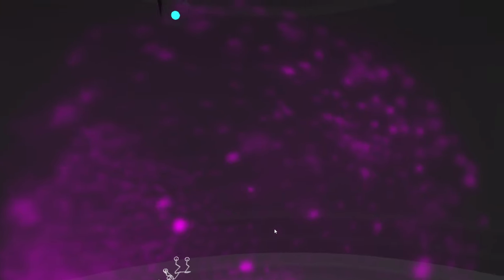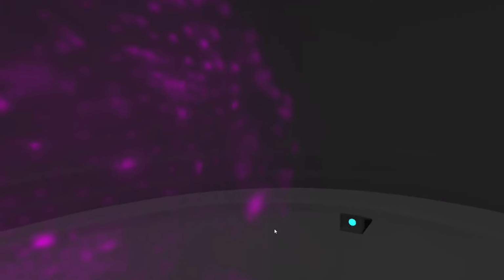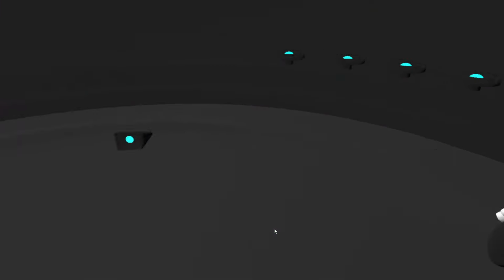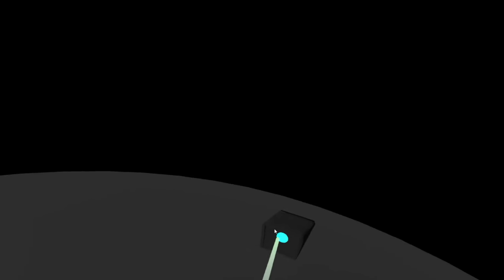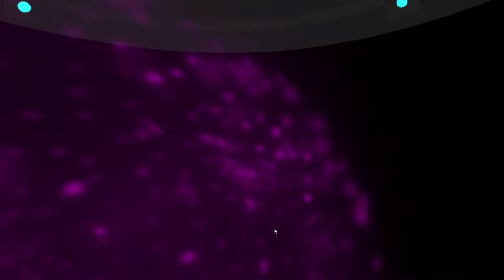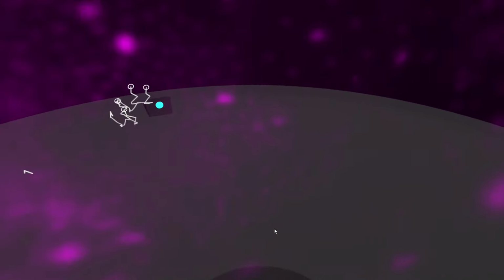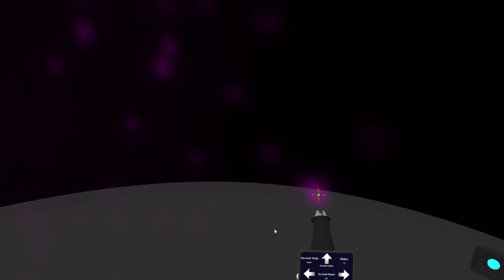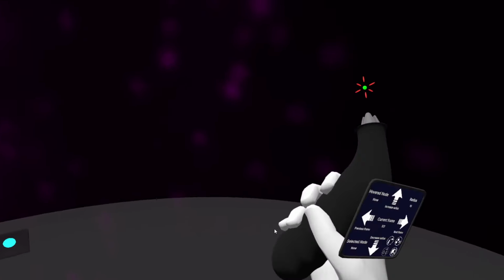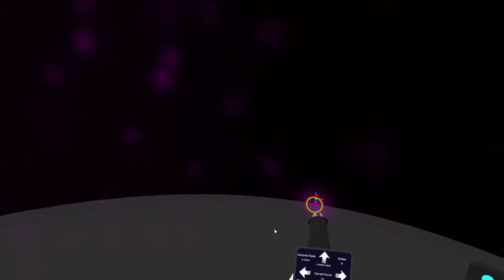All right, so this is actually a good example of a sort of low quality because this is further in time and it's a bit harder to see, but you can still see pretty well in 3D, and follow cells, especially if you go into black mode. All right, so let's take, for example, this cell over here. So this one. So in our tracking tool, the first thing is if I use the trigger, I can then add an annotation, right? So now I've added an annotation for this particular cell.